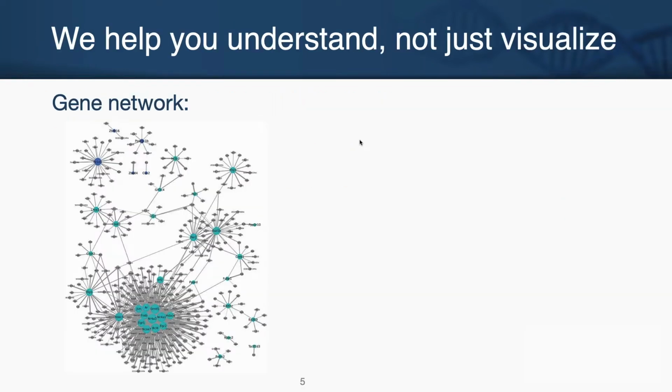Okay, people ask us what's different between us and the competition. And I think the most important thing is that the platform is really guided towards understanding the results, finding the story in your data very simply without spending hours digging.